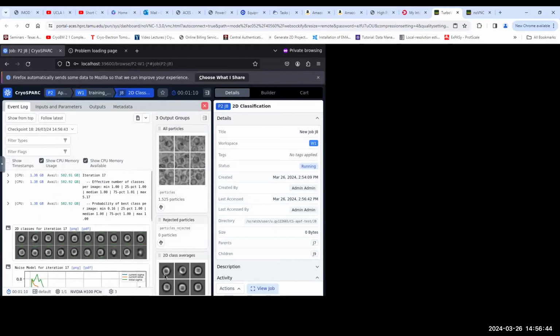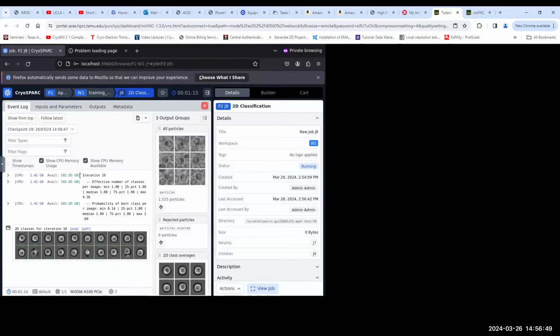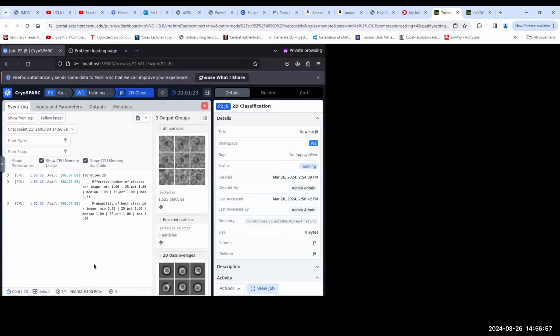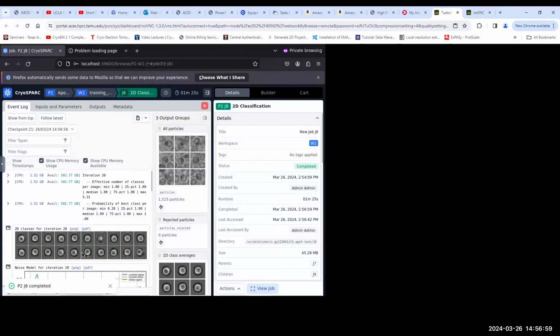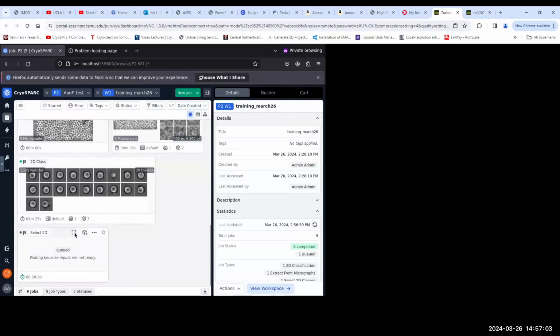So you can see now we already have some good class averages. It's almost done. Okay, that's finished, and this is waiting for us.